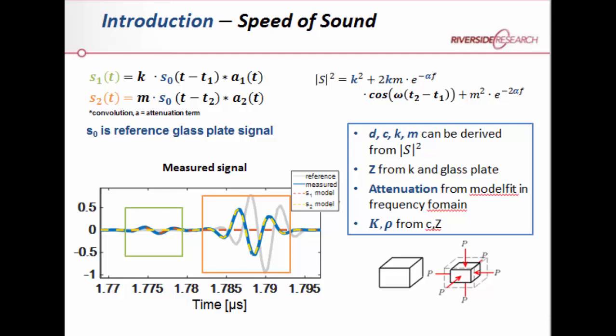Well, the bulk modulus somehow relates to the stiffness of the material, so you can consider it like if you would have a constant, unit change of pressure on the material, it would say how the volume of this material will change. And so that means higher bulk modulus means a stiffer material.